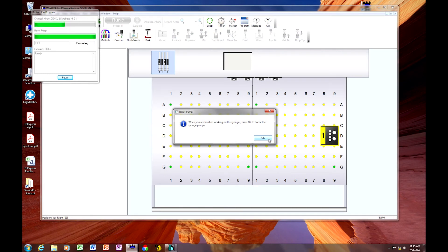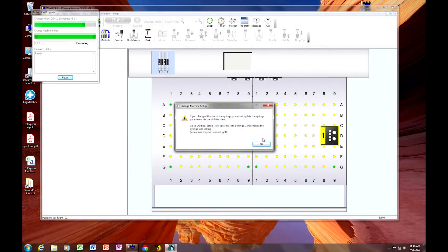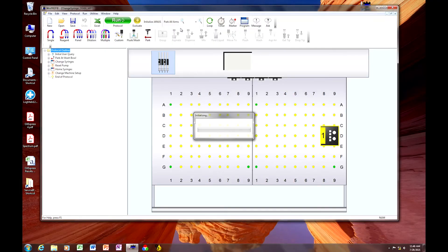Once you've completed the installation of the syringe and/or four-port valve, go back to the software and select OK. The syringe will return to the up position. You'll receive a message that says you must update the syringe parameters — if you haven't changed the size of the syringe, that should never be the case. Select OK. You can then go to Utility, Setup, Instrument, and Park All Arms to move the arms back to the left side so you can repopulate the deck. Finally, prime the instrument at least twice to clear all air from the system fluid. That completes the installation of the four-port valve and/or syringe.